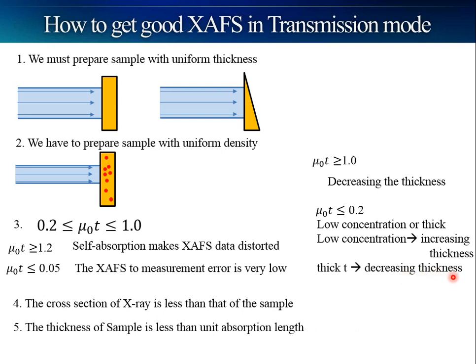Also, the thickness of the sample should be less than one unit absorption length.